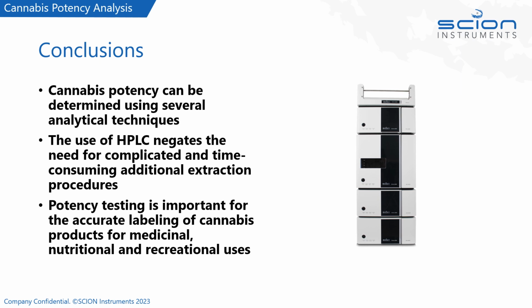Hopefully I've made clear that potency testing is very important for the accurate labeling of cannabis products for medicinal, nutritional and recreational uses. We've seen from our results that you can have a huge variation from what's on the label claim to what is actually present within the product.